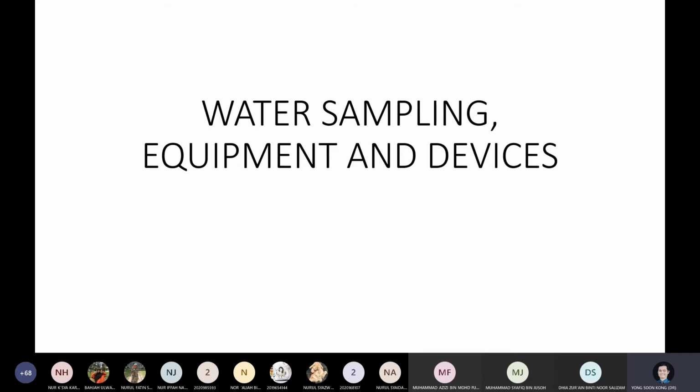Okay, now done with the sequence. Now, the sampling equipment and devices. This one is the technical part. Earlier we just finished talking about the management layer, what the strategies are, where we sample first, which one we sample first. That one is done. Now I'm moving on to the techniques. We're going to see what equipment and devices are involved. Once again, if we have so many contaminants, of course many pieces of equipment get involved here depending on what you want to analyze.